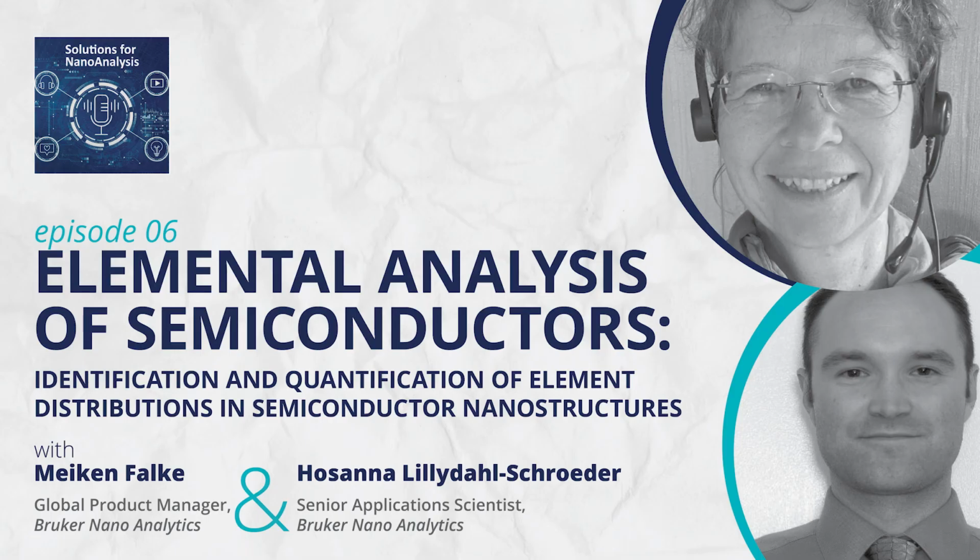Or deconvolved. All right. So you mentioned FIB work in your last discussion here. So speaking of focused ion beam, we discussed that with applications to TEM. But earlier I also asked you about SEM and different length scales. So what sort of things can we also do in SEM? Because in some ways, with the field emitter technology that's coming out lately, there's almost some blurring of lines as far as what length scales you can look at and investigate with EDS in SEM versus TEM.